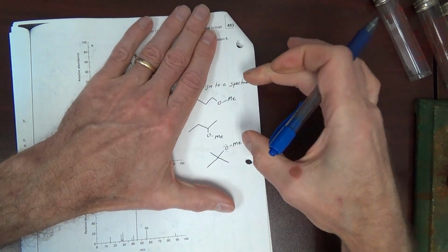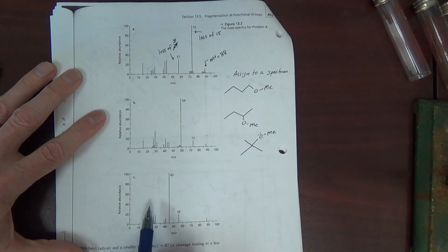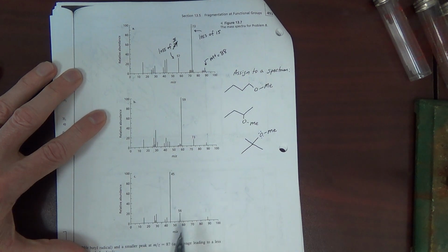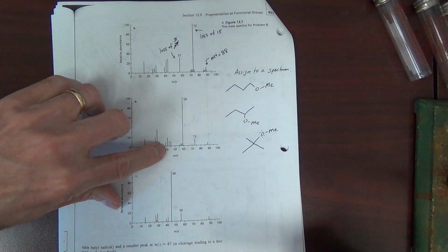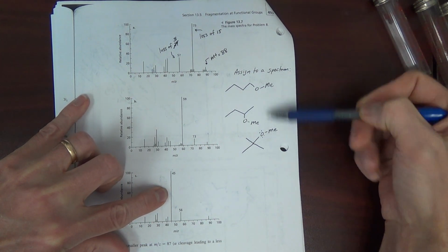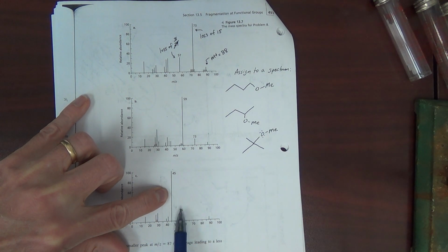Have that. Only after you do that, then you look over here and say, okay. Now this came from a textbook, and they were nice enough to sort of give you numbers which make you sort of focus in on that. Base peak of 73, base peak of 59, base peak of 45. Small 45. Back over here, did you predict a fragment of 45 for any of these? If you did, it's most likely going to belong to this mass spec.